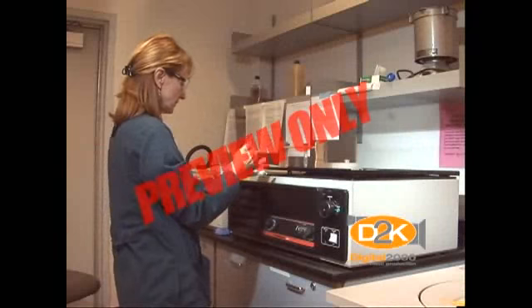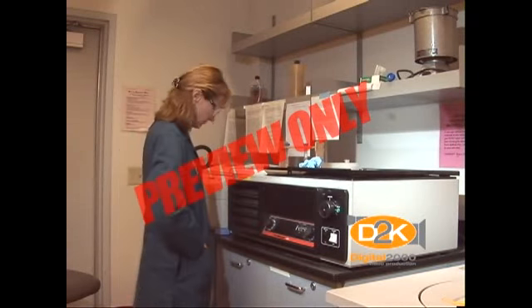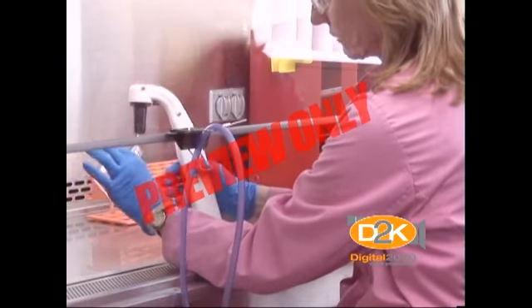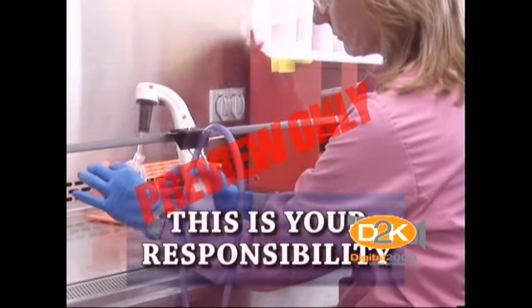When you are working with infectious agents or potentially infectious materials, you must be aware of the hazards associated with your work. You must be trained and proficient in biosafety procedures and techniques. Ultimately, this is your responsibility.